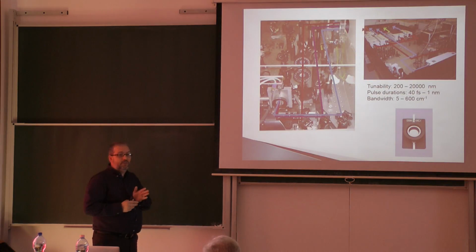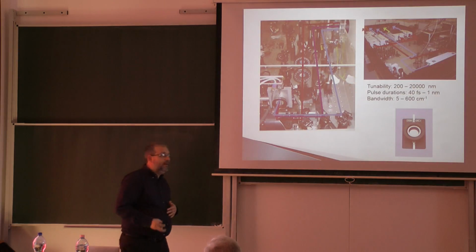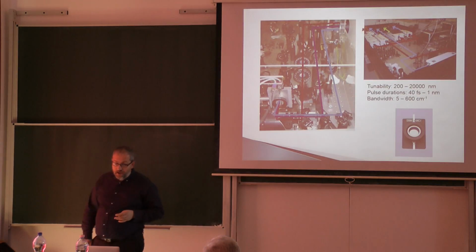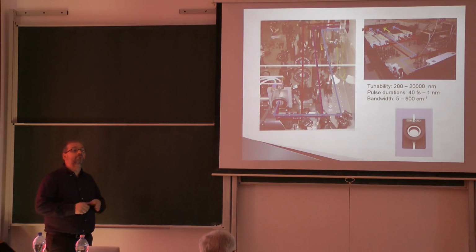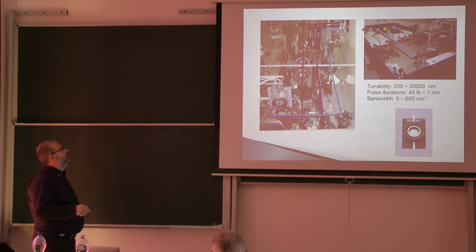The problem is that if you want to have some signal from this amount of sample, you have to increase the protein concentration, and typically it's about 1.5 to 2 millimolar protein concentration here, which is quite high, quite a lot. So this is a disadvantage compared to, let's say, fluorescence or visible transient absorption. Now what happens here is that we are exciting with the blue beam, and we are probing with the other beam, which represents the infrared beam here.